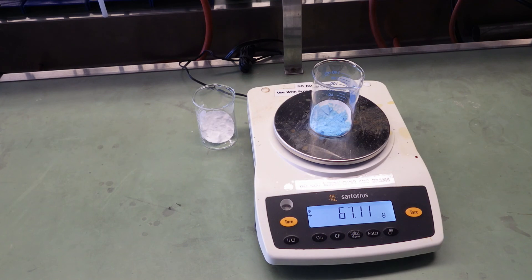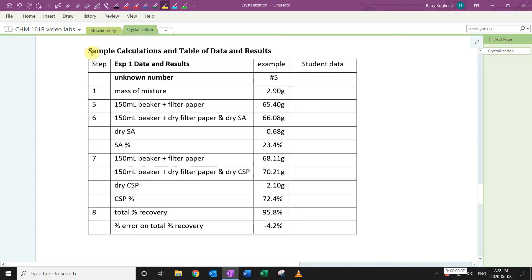All right, 67.10 grams. You want to record those masses for your data and results. Please enter them into the table that's listed in your lab procedure. There's a worked example here that you can follow.